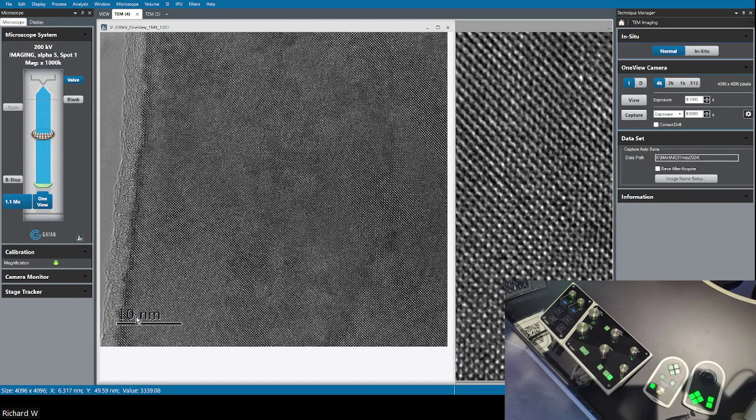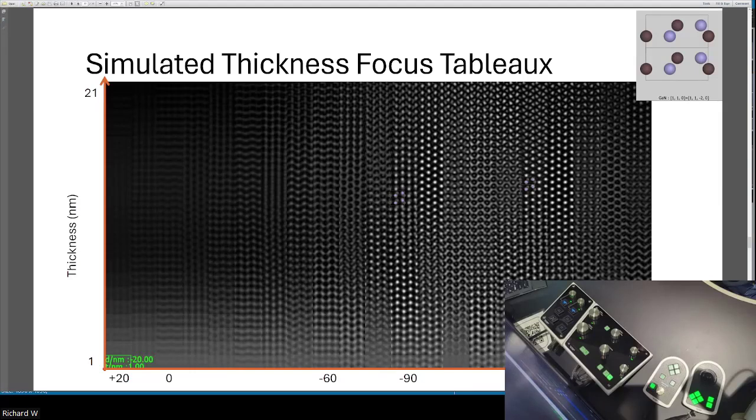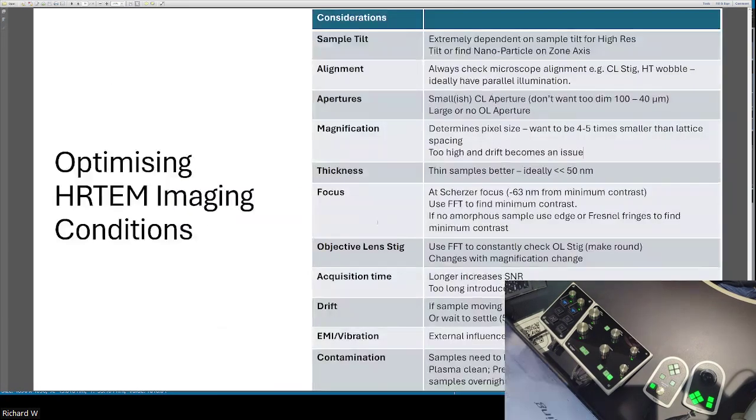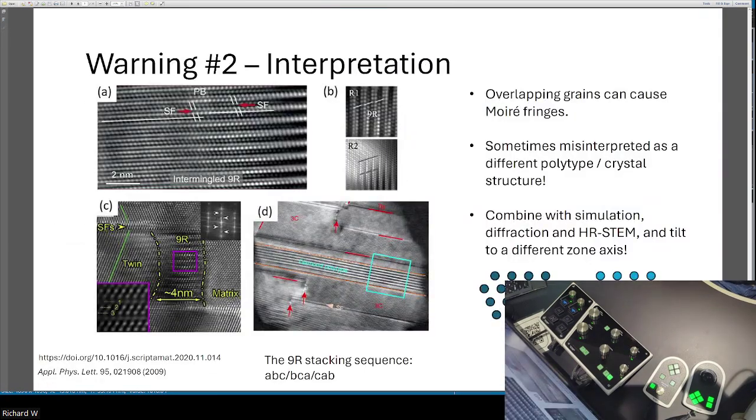Thank you. There is one question again from UNSW. Yesterday you mentioned that we need to really care about analyzing the HRTEM, for example in the case where we have some overlapping lattice, like the 9R case. Is there any technique to resolve this, like maybe changing the angle of the beam or tilting the sample? Yeah, good question.